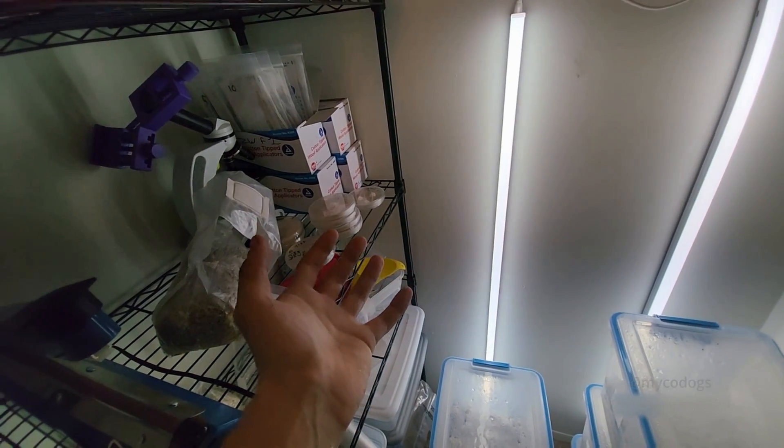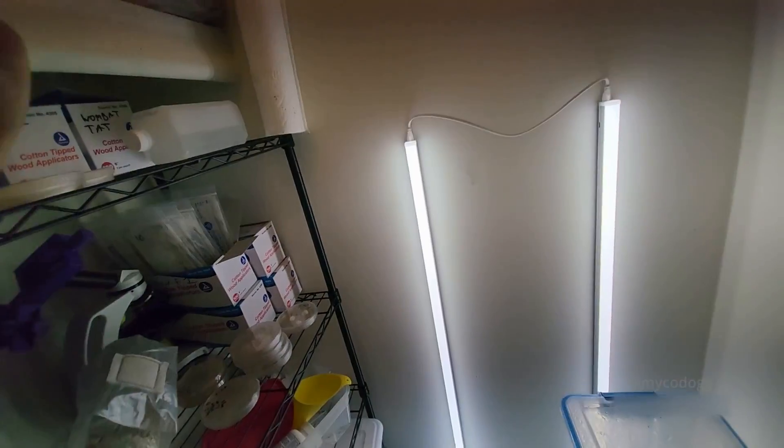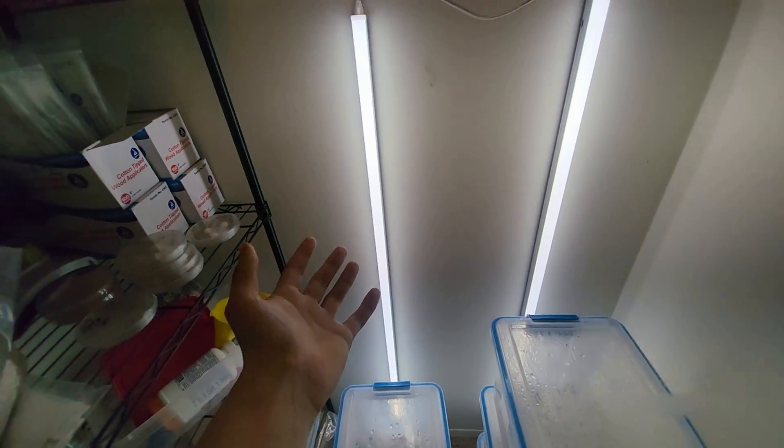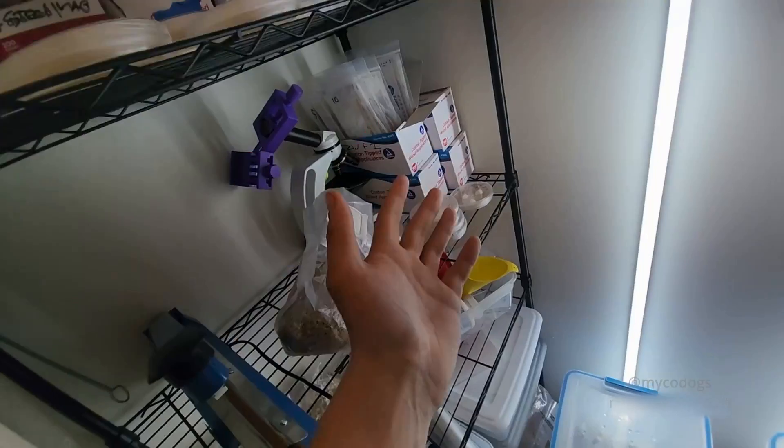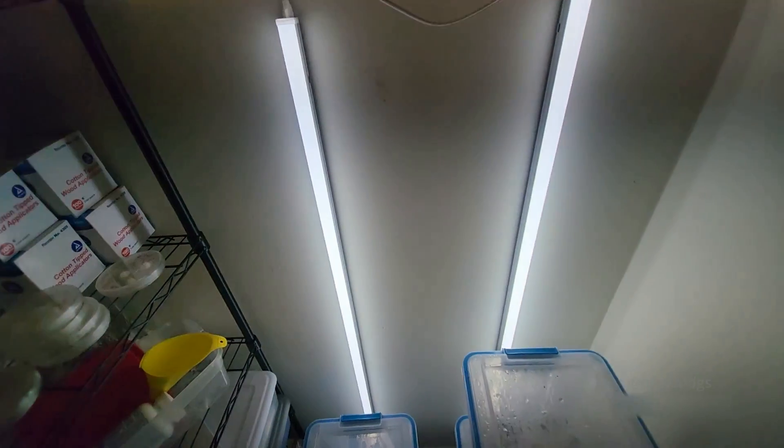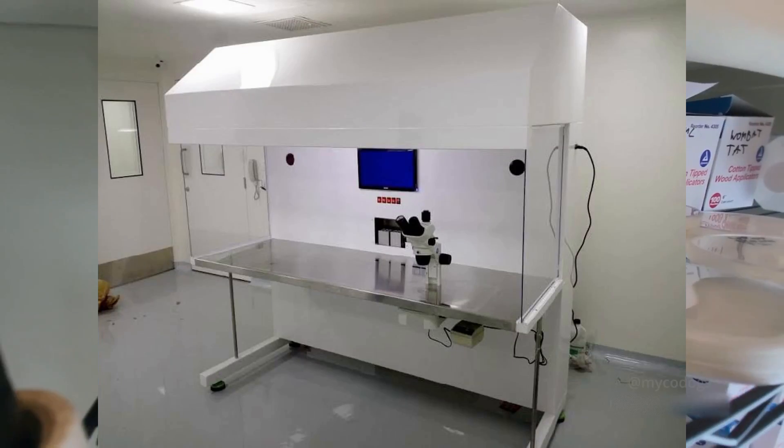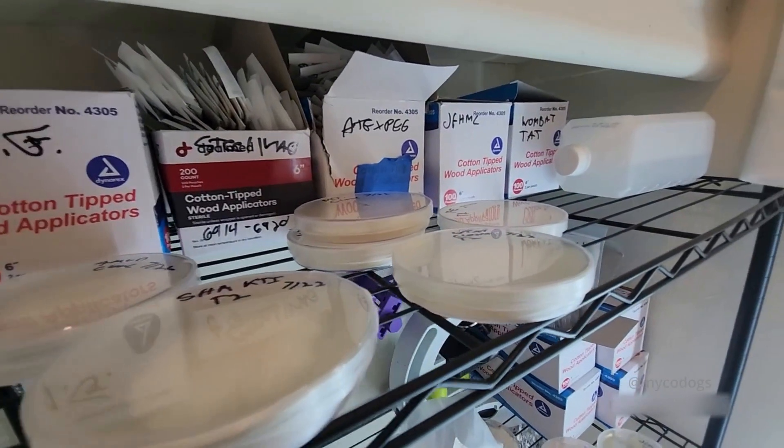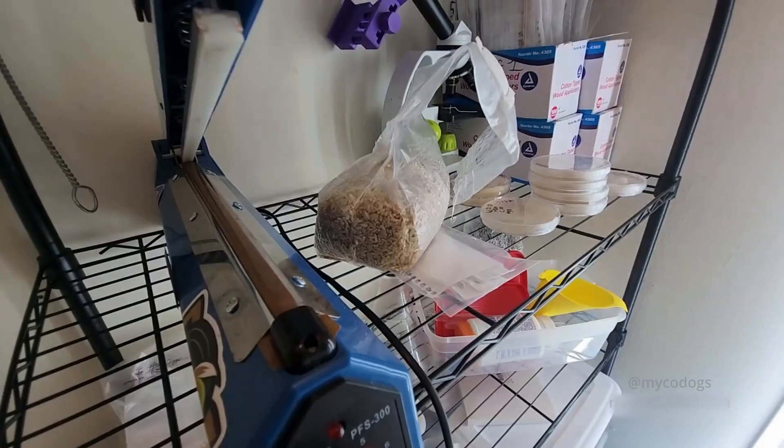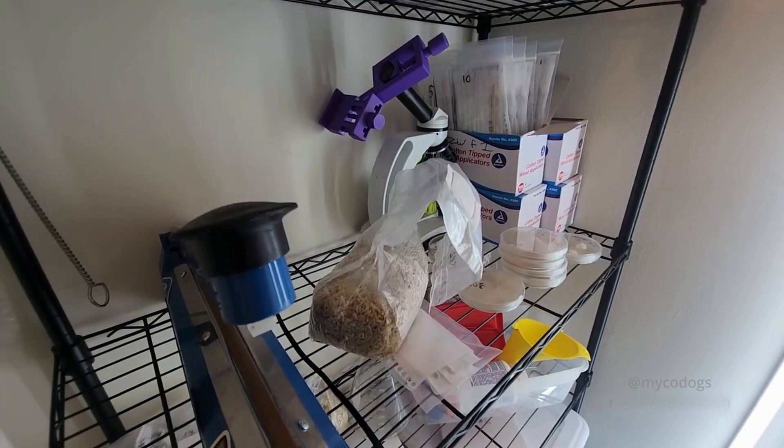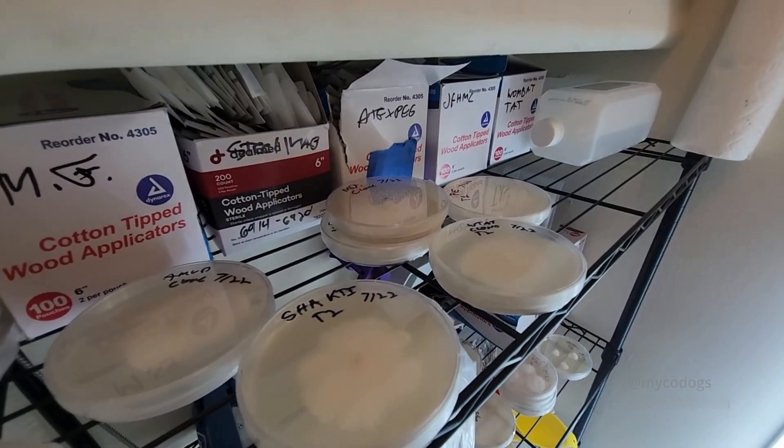While most of us can't afford to redo our HVAC system to create a positive pressure clean room, a laminar flow hood seems like a logical next choice for a lot of people, if you believe they are necessary to achieve a sterile workspace. But do you really need one? Laminar flow hoods or fan filter units can cost hundreds or thousands of dollars. Unless you are growing at a commercial scale for profit, which I do not encourage, it becomes hard to justify these expenses. You might think a flow hood is more sterile than a still air box, but if used correctly, both of them have a contamination rate close to zero percent.